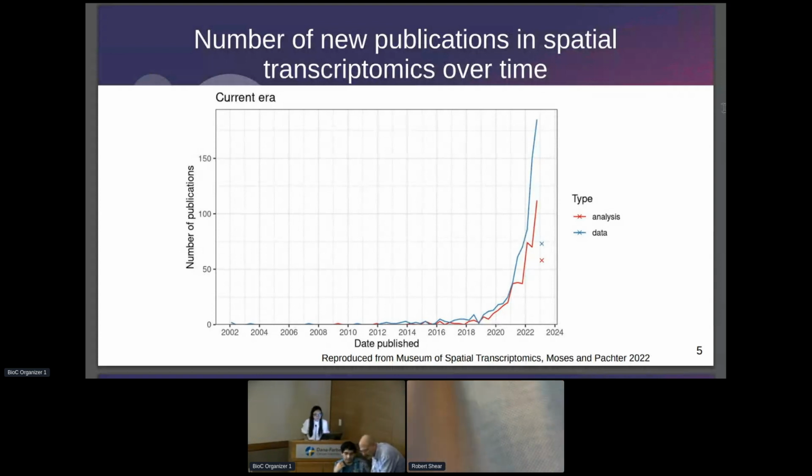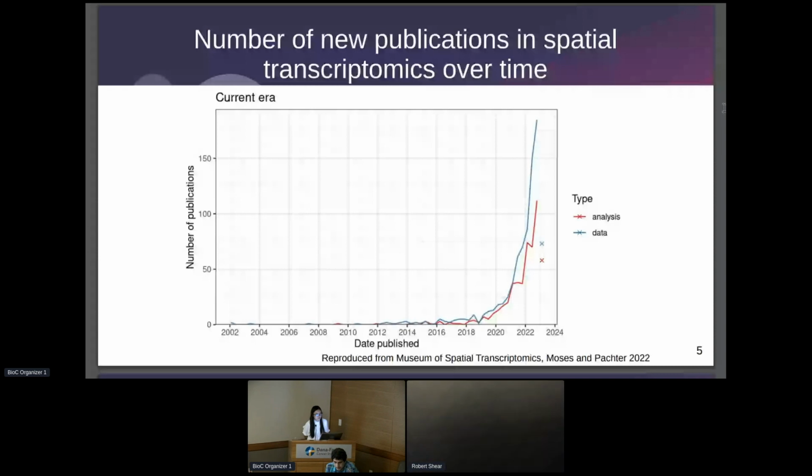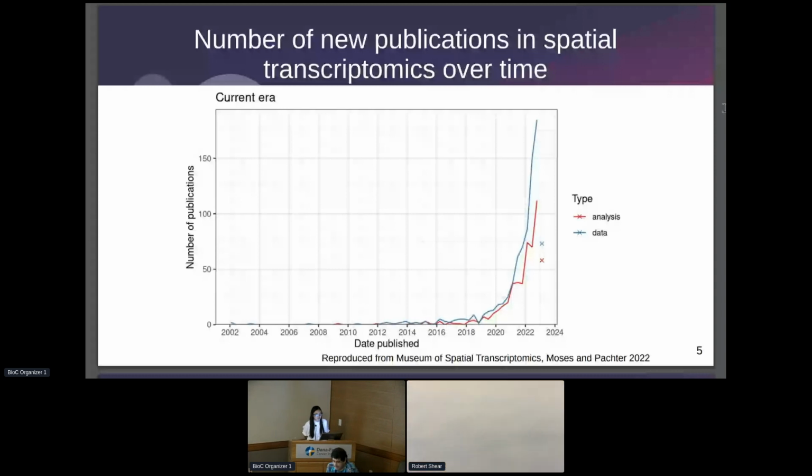However, spatial data analysis has existed for decades before the rise of spatial transcriptomics, mostly in geography. This is a timeline of some of the classic publications for some of the methods used in Voyager, although this field is still continuously evolving.